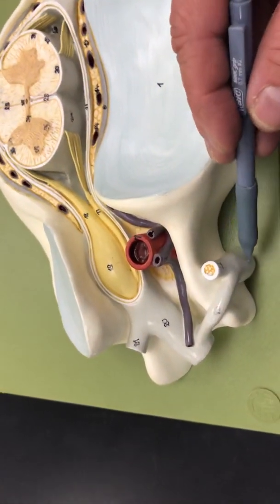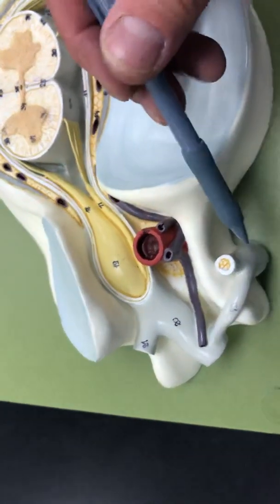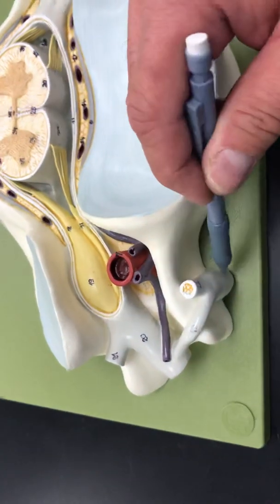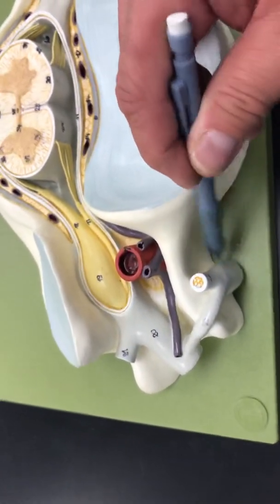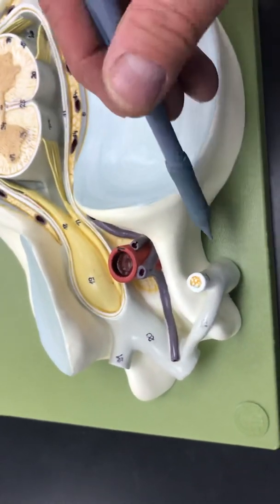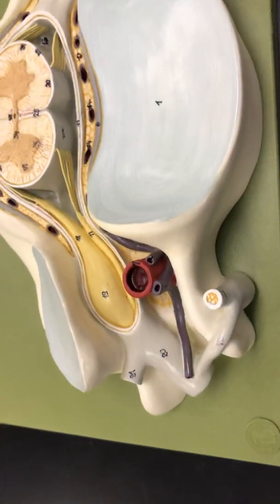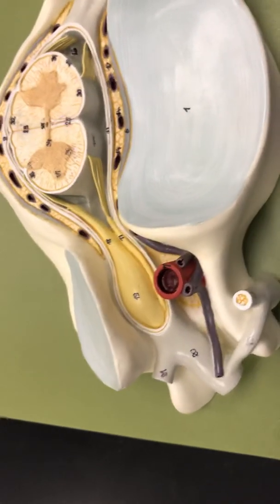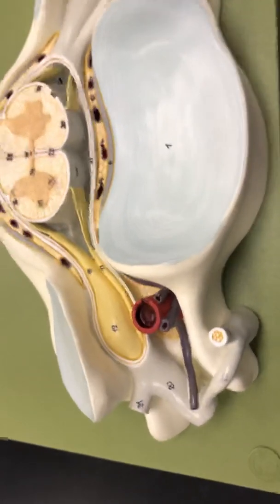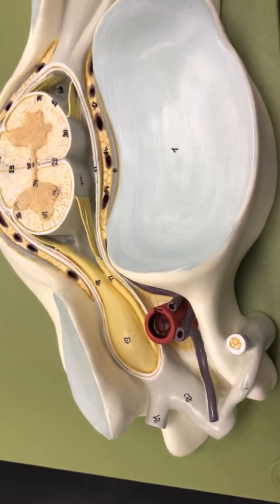The sympathetic ganglion is a very long series of cell bodies that are very, very close to the spinal cord. Those sympathetic ganglia contain cell bodies that have axons that go to the heart. They'll go to the lungs. They'll go to the eyes even. So then you have a global response when we have sympathetic activity.